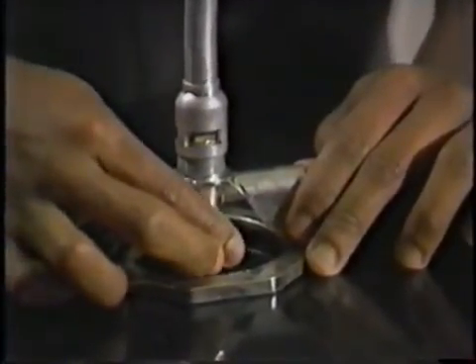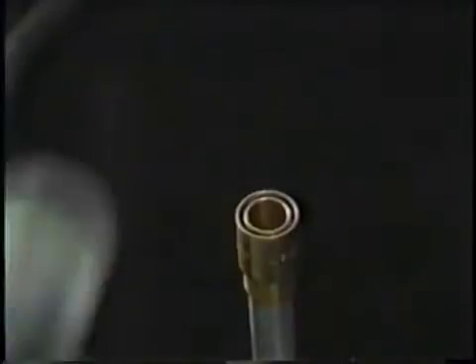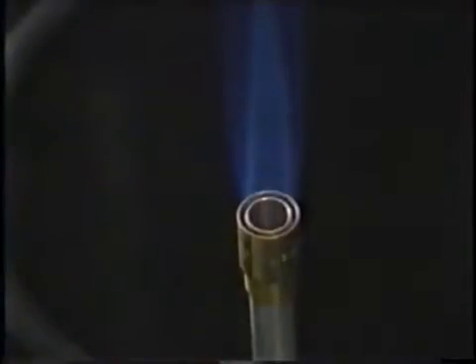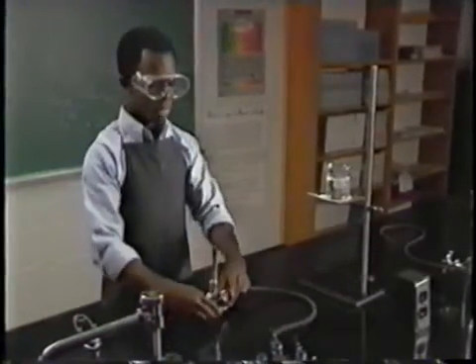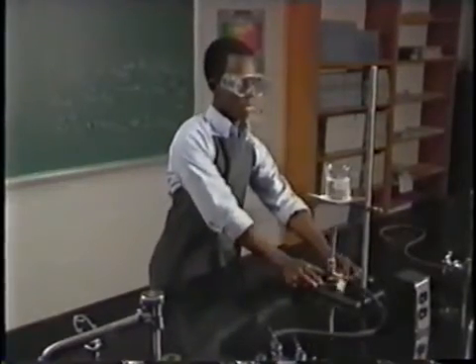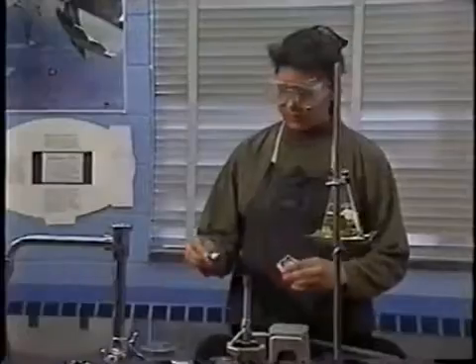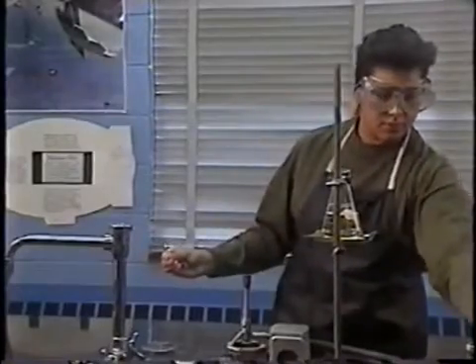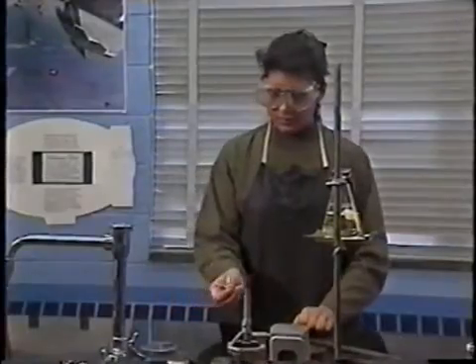You can light a Bunsen burner with a striker or a match. Open the gas line valve and light the burner. If the flame is properly adjusted, you can place the burner under your setup. When using a match, strike it away from you. Turn the gas on after the match is burning — that way, gas won't escape while you're striking the match. Light the gas from the side so the match isn't blown out.